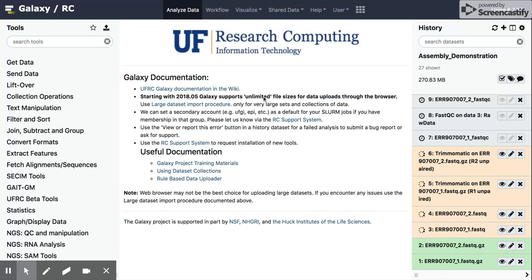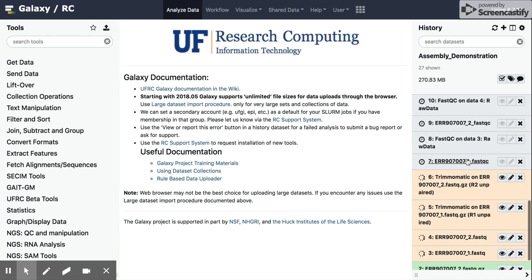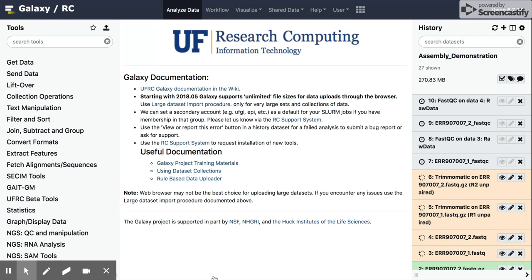So we'll come back and see how this ran, and then we'll also talk about assessing each one of these steps, for example, Trimmomatic, using the output from FastQC.